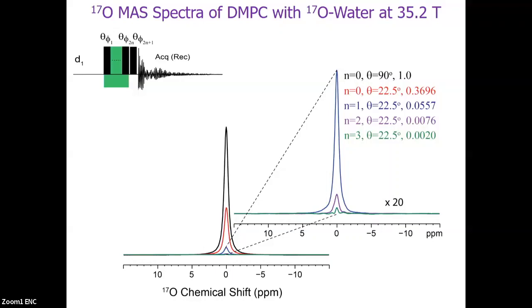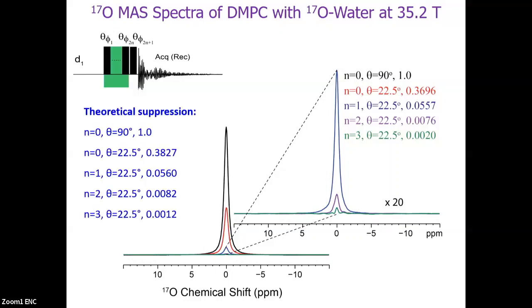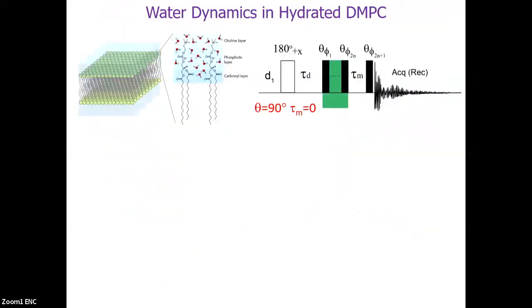And this is the suppression value we get. If we compare to the theoretical suppression, it agrees very well, which means this method works experimentally.